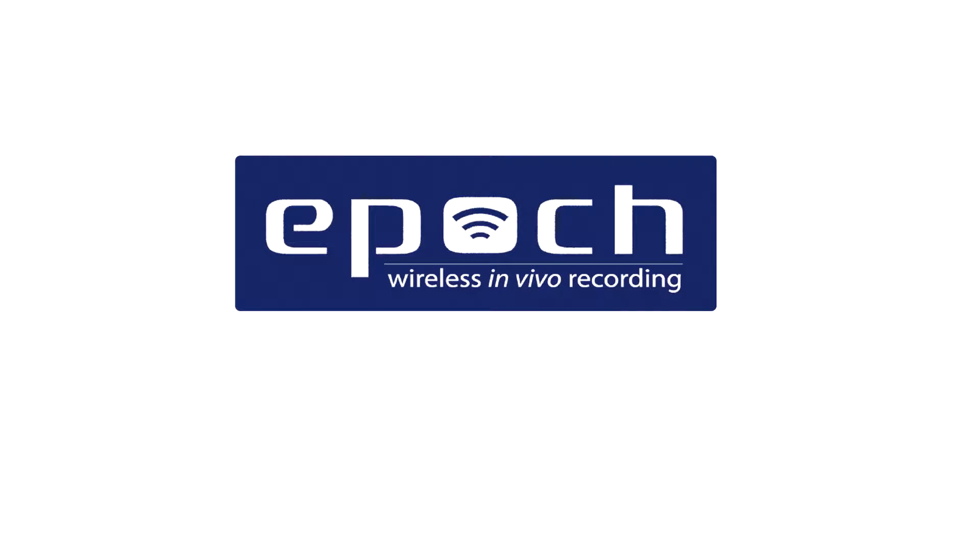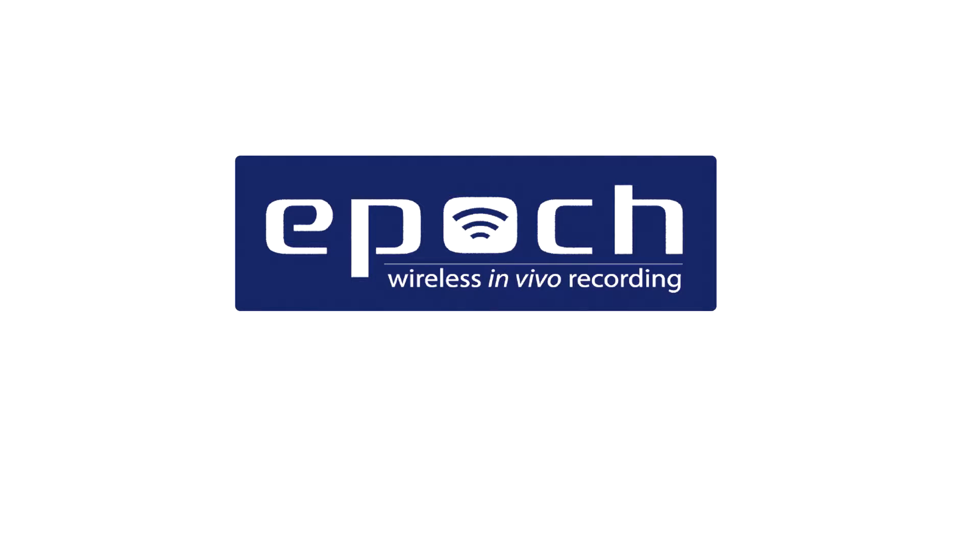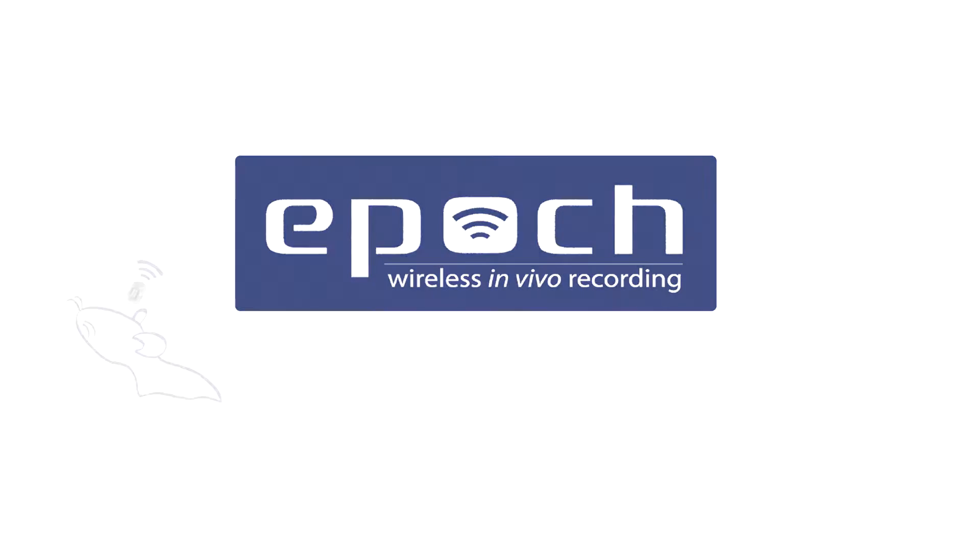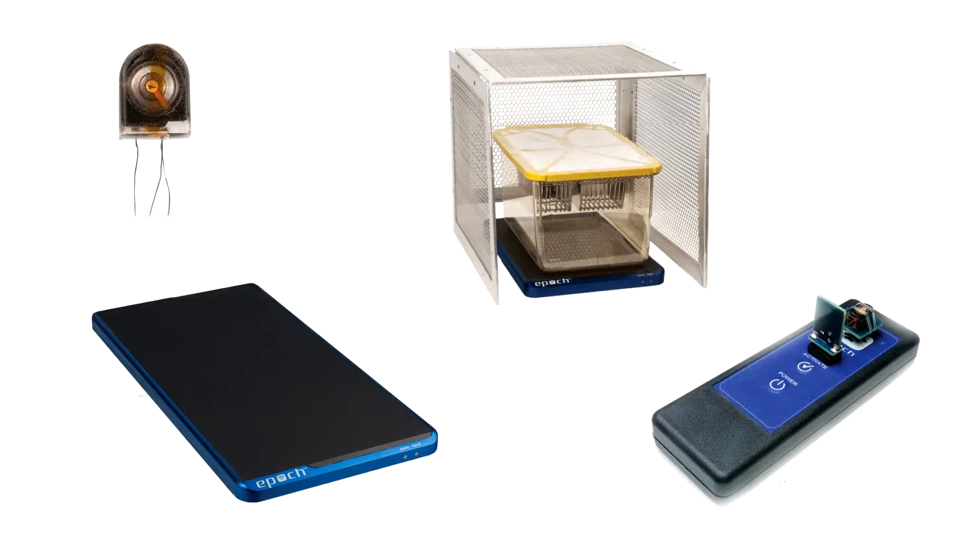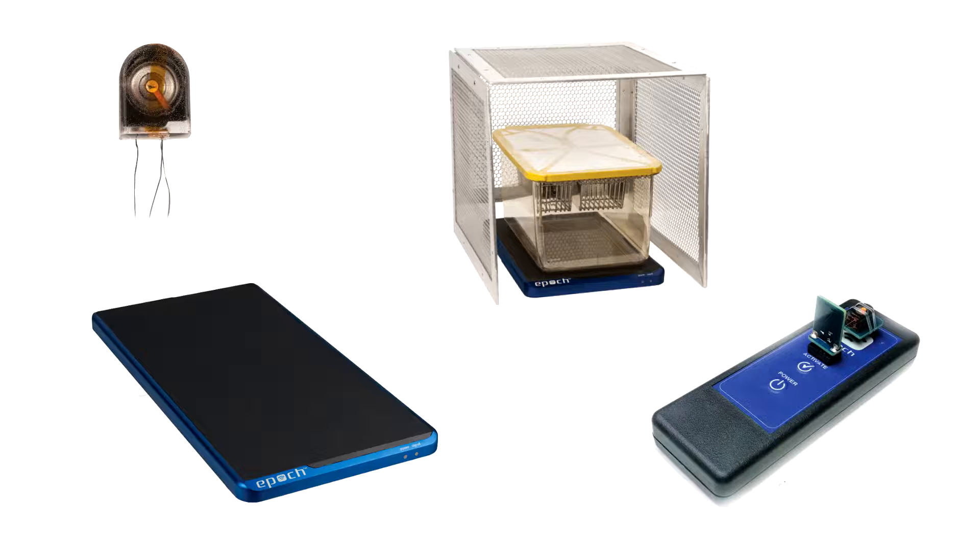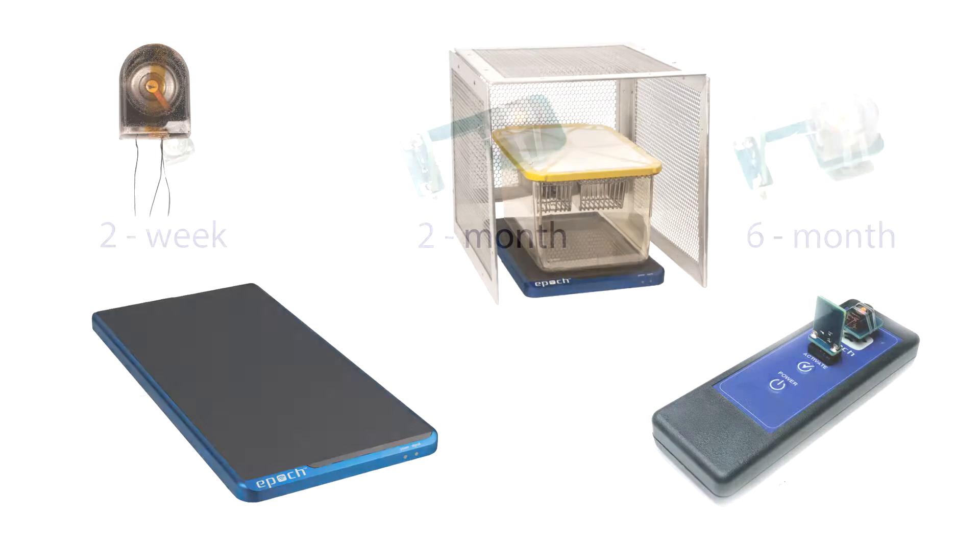Now available from Biopac Systems, EPOCH Wireless in vivo recording systems are a low-cost solution for continuous, long-term biopotential recordings from rodents. This overview details the components of EPOCH Wireless in vivo recording systems.